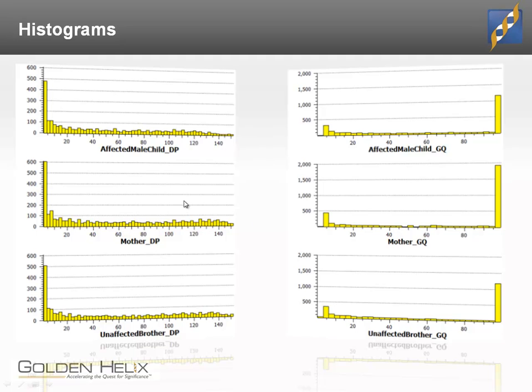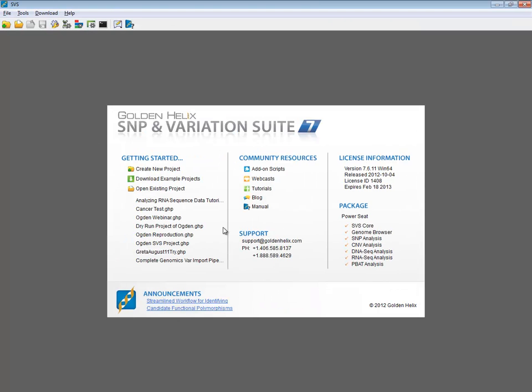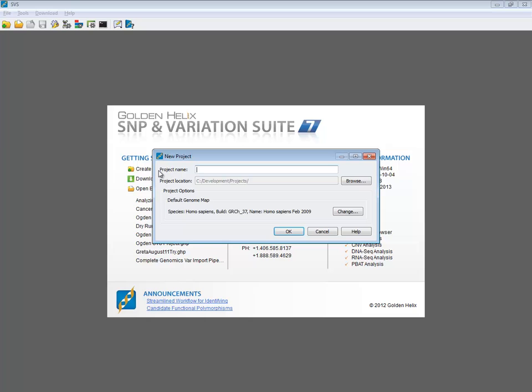Okay, so what we're going to do now is jump on over to SVS, import these VCF files, and get started with this process of filtering. So I'm going to go ahead and open SVS. I'm going to maximize it here so we're not distracted by anything. And SVS is, again, as I mentioned, a powerful suite of tools with a number of different modules to focus on different experiment types. But we're going to focus on just using that DNA-Seq module.